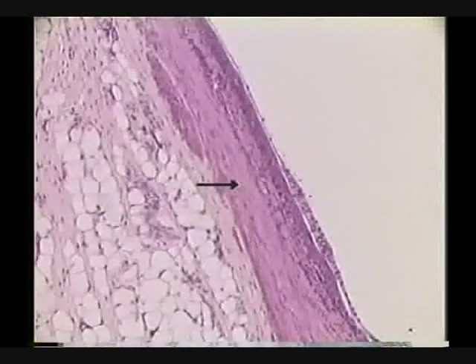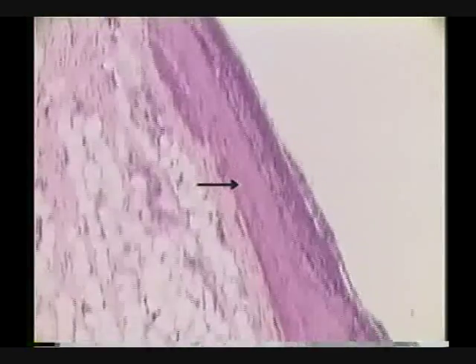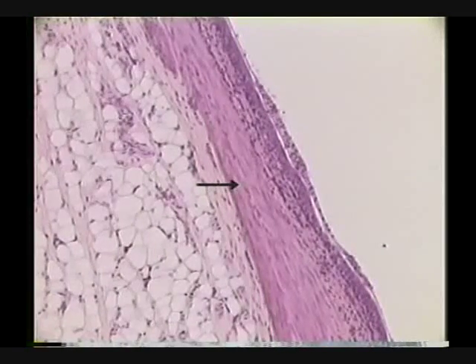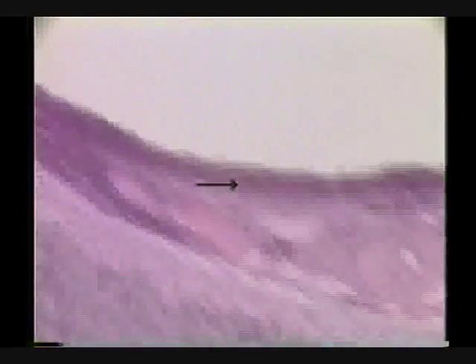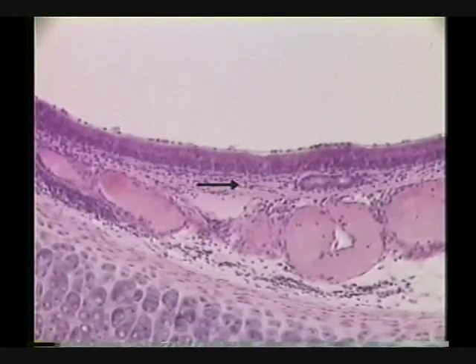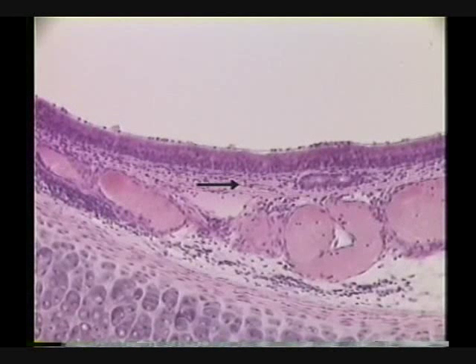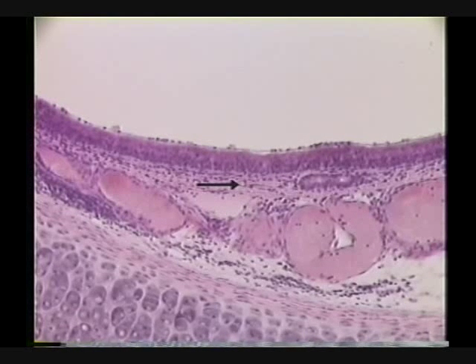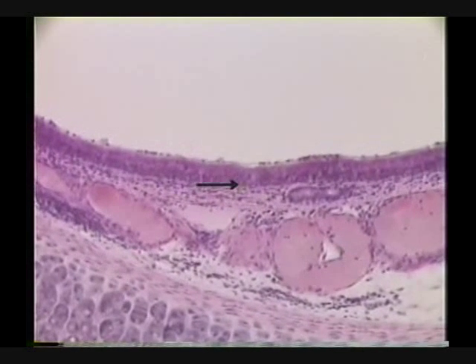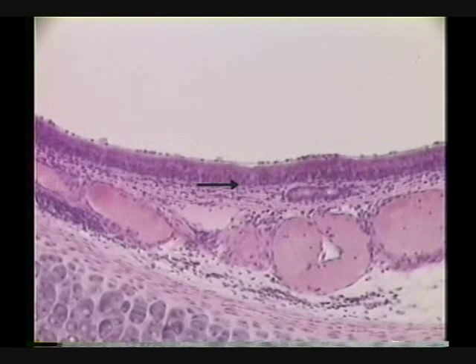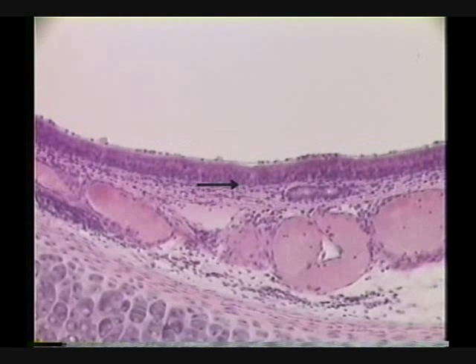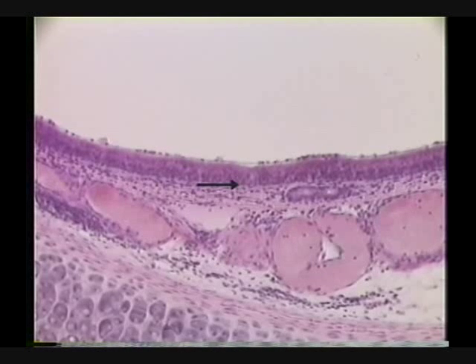Identify the tissue indicated by the pointer. The tissue is smooth muscle. Identify the layer indicated by the pointer. The layer is lamina propria. Identify the secreted noncellular layer at the tip of the pointer. The secreted noncellular layer is basement membrane.